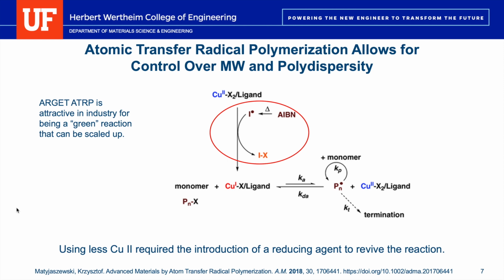In our experiment, we decided to synthesize a polymer of about 20,000 monomers and used literature to determine parameters, which in our case allowed the reaction to occur for about 30 hours. Samples were taken intermittently throughout the reaction. Once the reaction was completed, we had to first remove other solutes in solution using alumina in a column. Then we were able to purify the polystyrene in methanol.